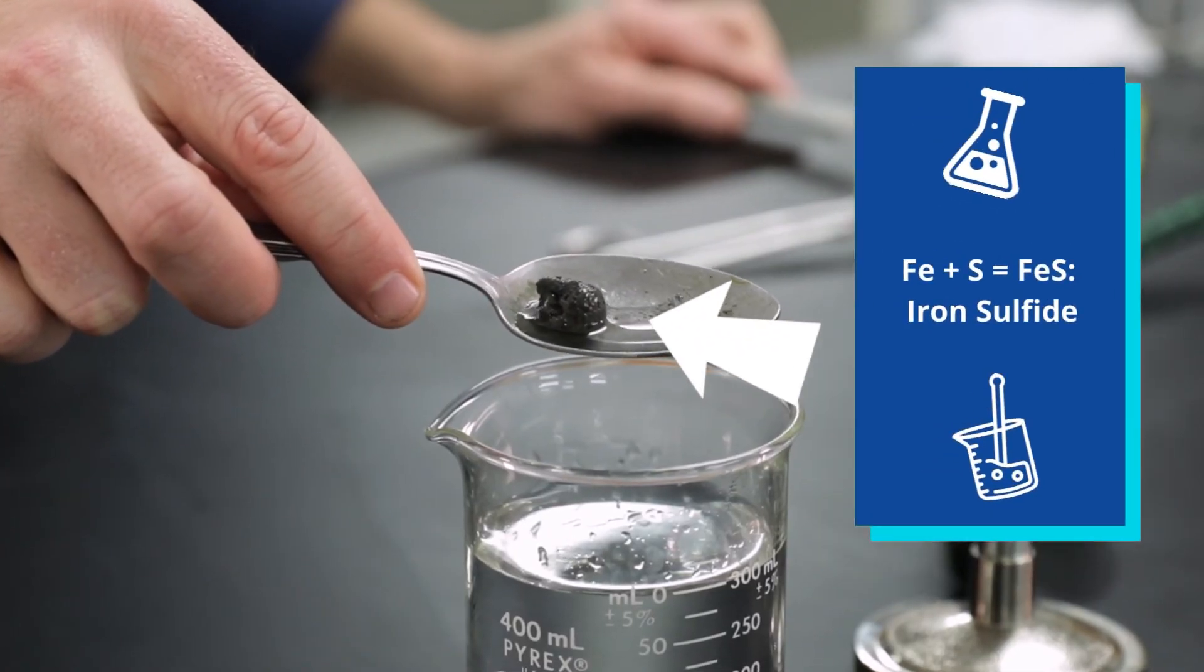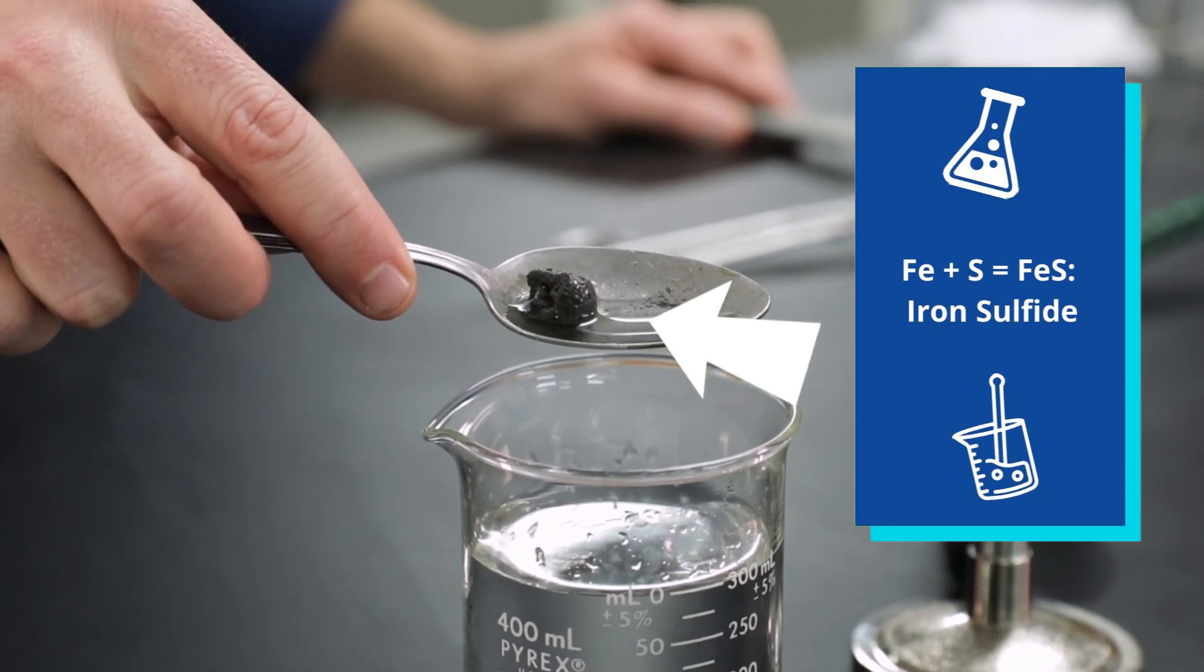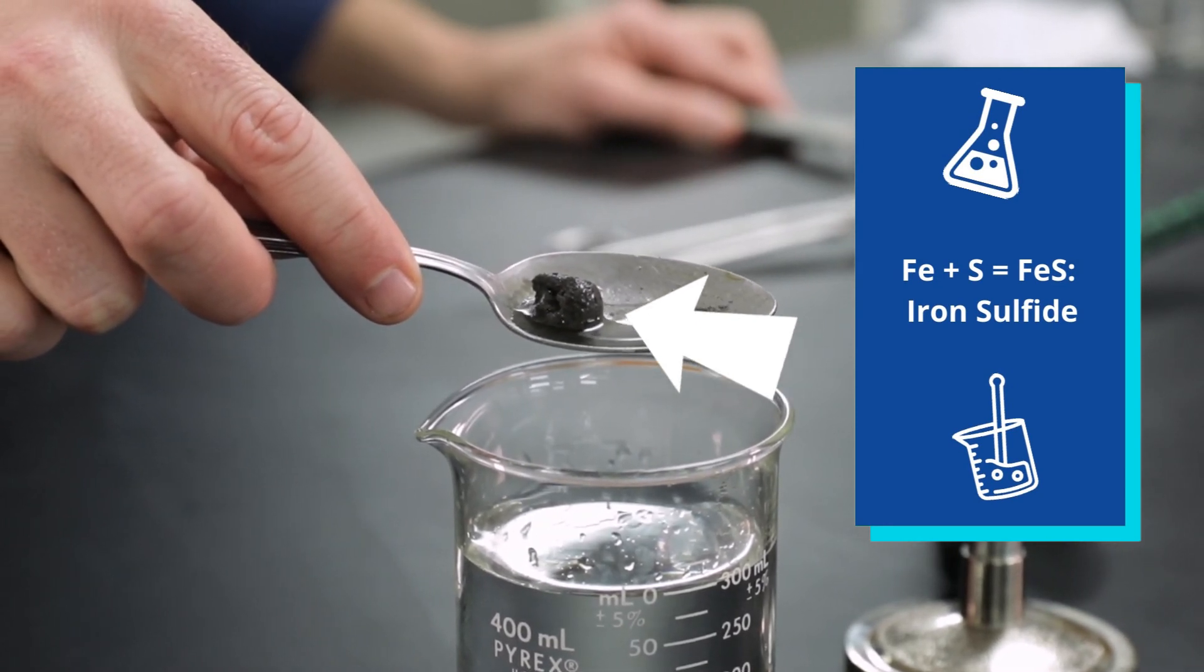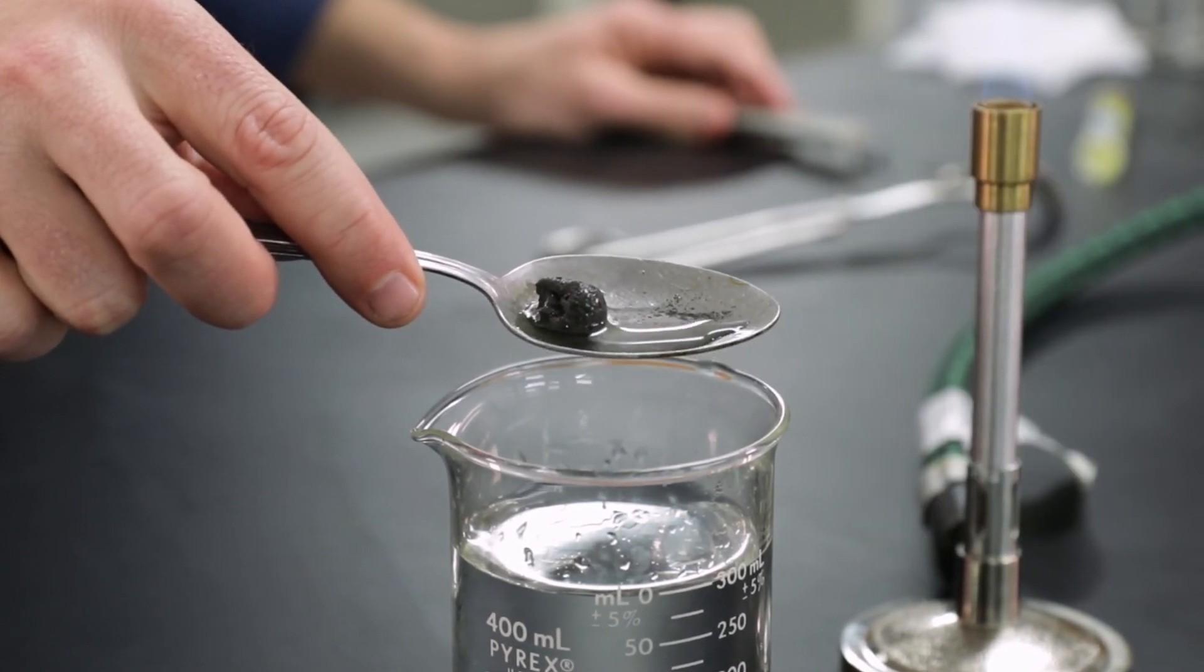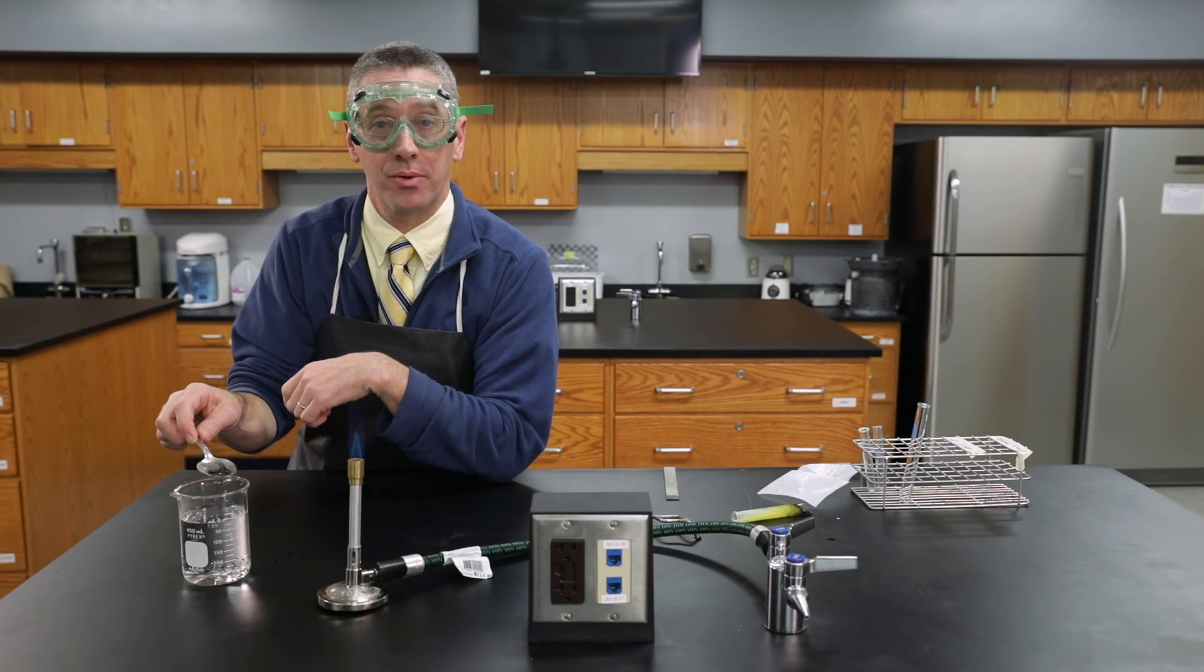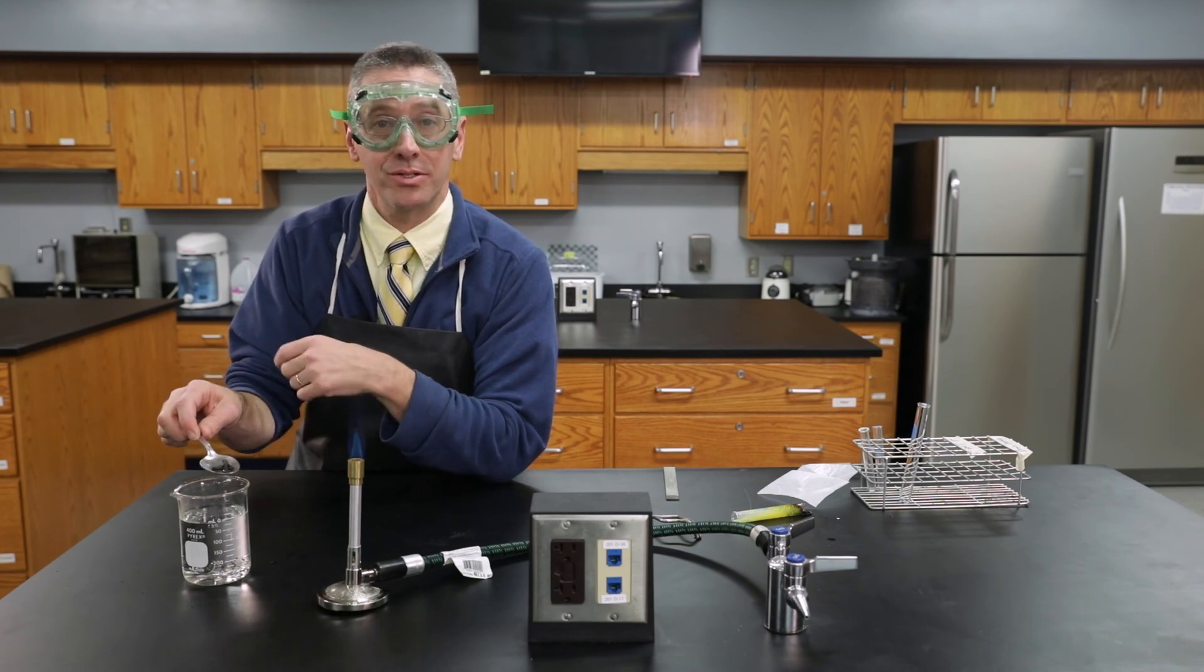Now you can see the iron sulfide is not magnetic anymore and it's not yellow either. It doesn't have the properties of iron or sulfur because we've had a chemical change. Iron sulfide is a brand new product with its own set of properties. This was a synthesis reaction.